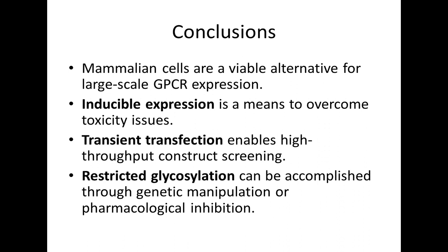Thank you. Okay, next one is, how about BacMam systems? Is it a nice balance between these two systems to overcome DNA gigaprep costs?